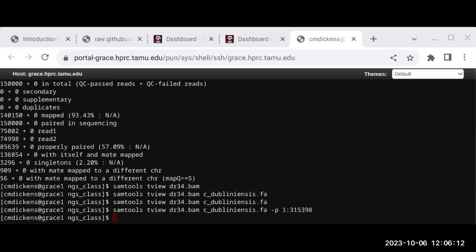Use the temp dir if you can, but realize that if you put everything in the temp dir and your job fails, all the data's lost. Not your input data, but the analysis results are lost. So if your job fails halfway and you're in the temp directory, there are these checkpoint files that get saved. Those are deleted also, so you have to start from the beginning. If it's a small genome, it might be good just to use the temp directory.